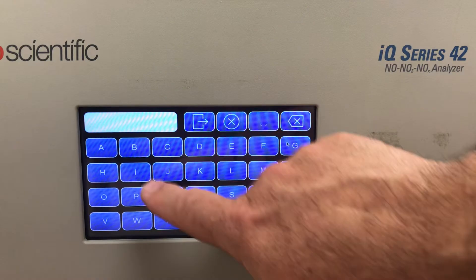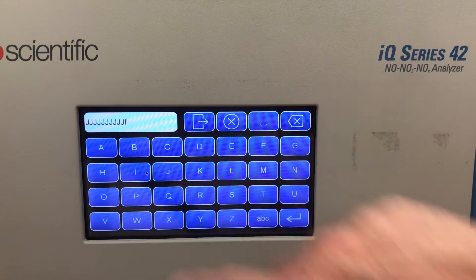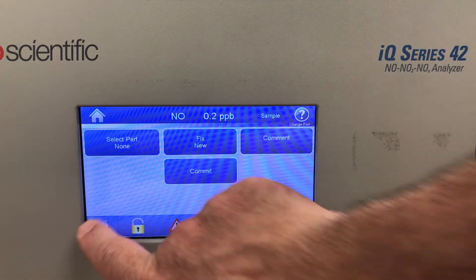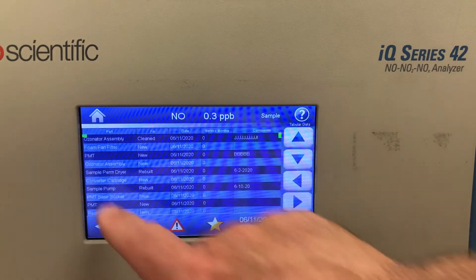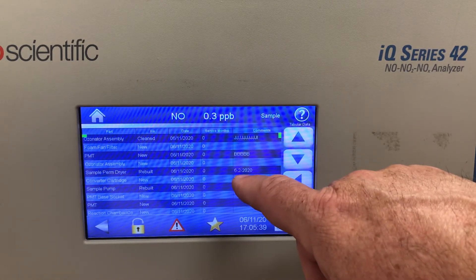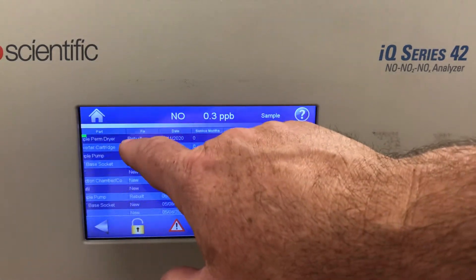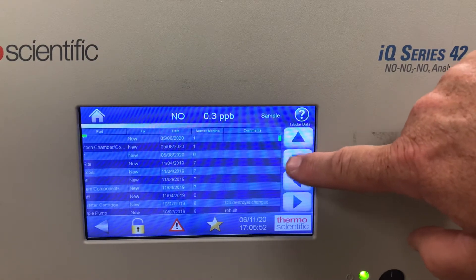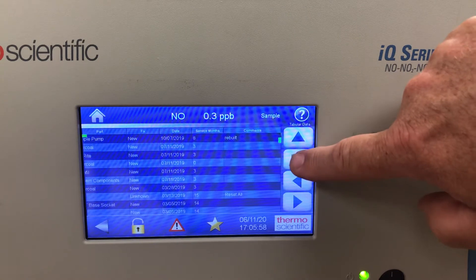I can add a comment in here — you can put text notes about when you did it and what day it was done. You can save that and commit it. I can show you where that was saved by going to maintenance history. In there I can look at my ozonator assembly, see it was replaced new, the date, and the comment I entered. You can do that with many different parts — Purifil, sample pump, capillaries — so you have a maintenance history of what was done by the previous person who serviced the instrument.